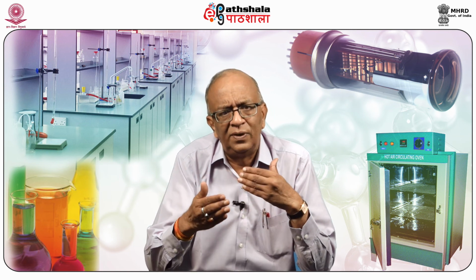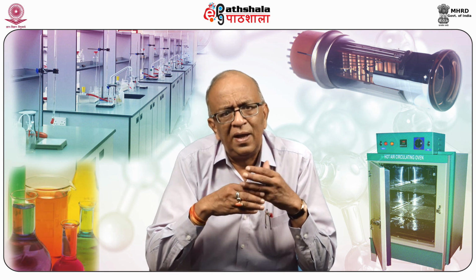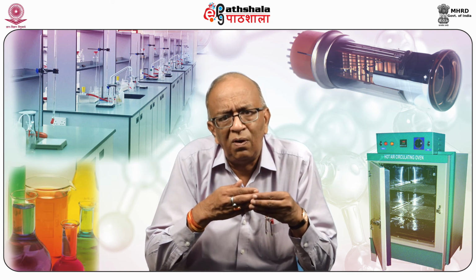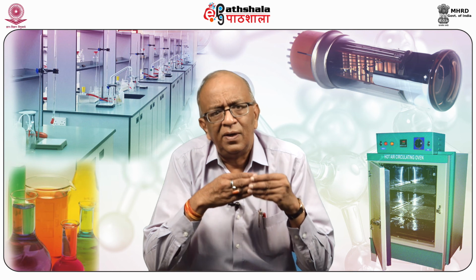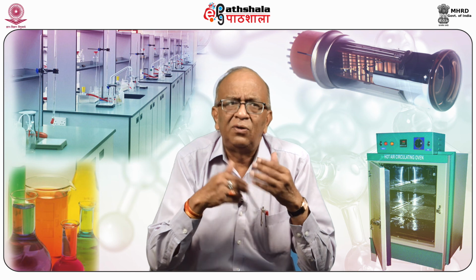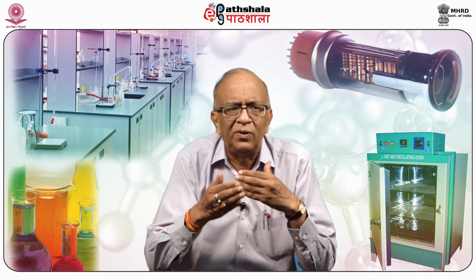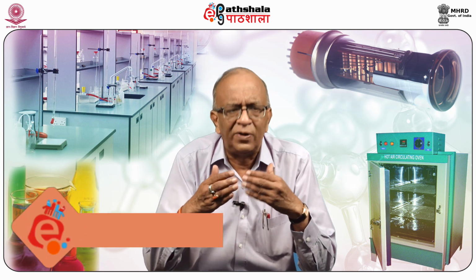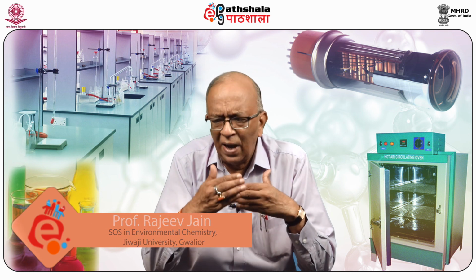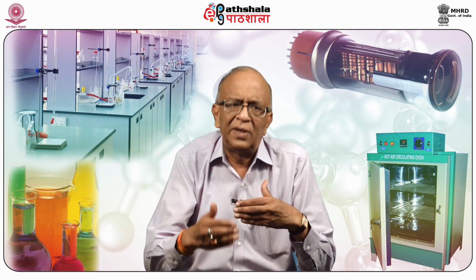With temperature, decomposition will take place or some reaction will take place, that is the chemical changes. A DTA curve in which there is an exothermic peak and endothermic peaks are obtained, DSC can be used for all applications of conventional DTA. So these thermal analyses, as I told you, are used frequently in studies of polymers, for characterization of hydrated water molecules in a complex or coordination compounds, or for identification of unknown different types of materials. Thank you.